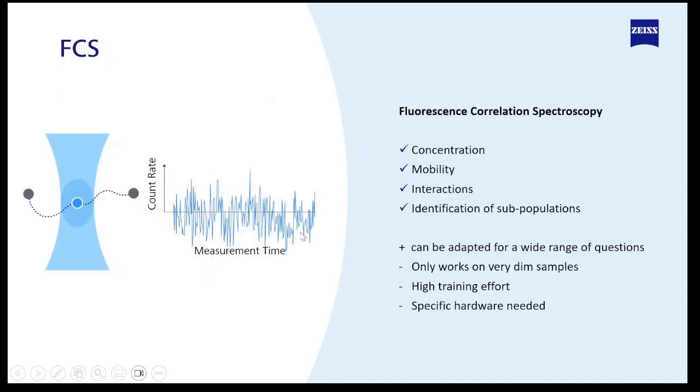So actually on a confocal system, there is another option to measure molecular dynamics, which is FCS, fluorescence correlation spectroscopy.